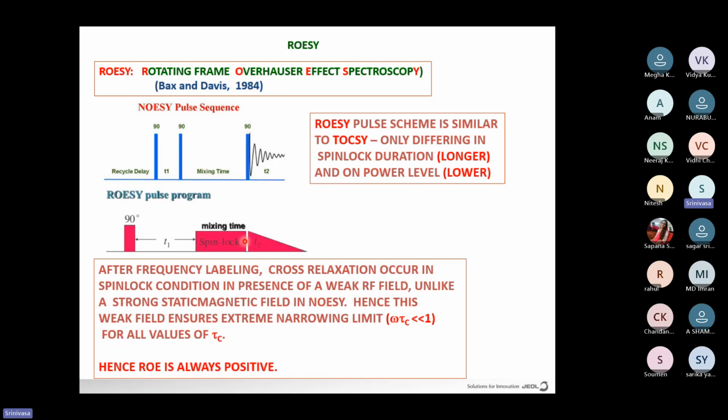What it will do is, it's similar to a TOCSY experiment. Once you transfer magnetization to the next spins, we are relaying it. I mean, we are just proceeding further. We are just applying the power on that. So it's like the spin lock power.